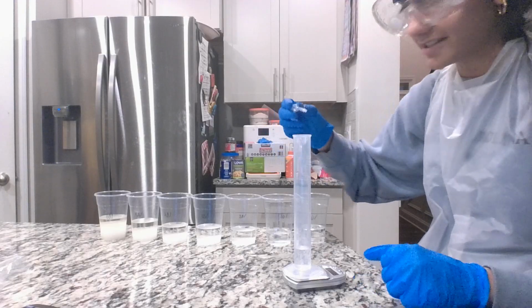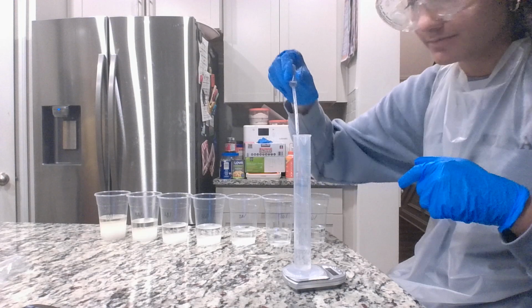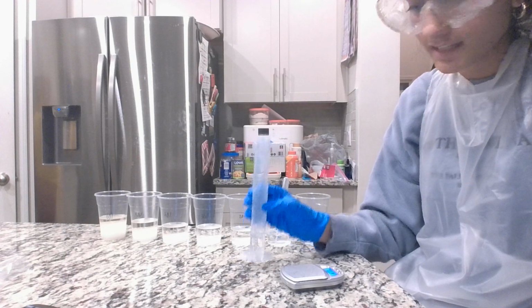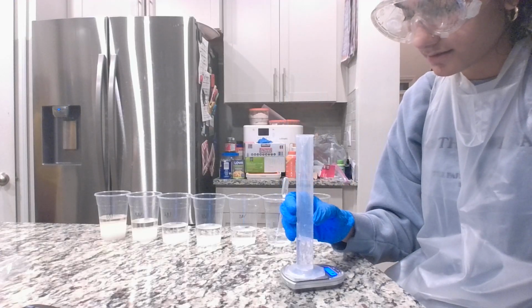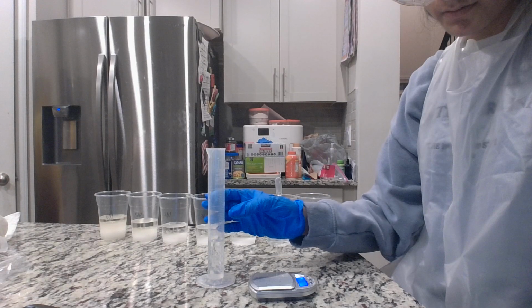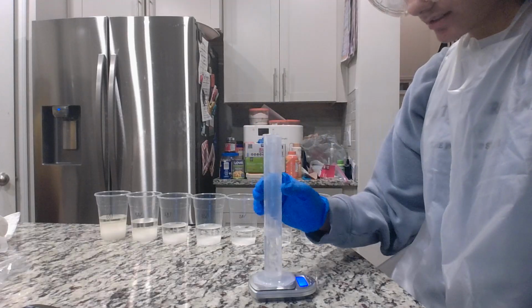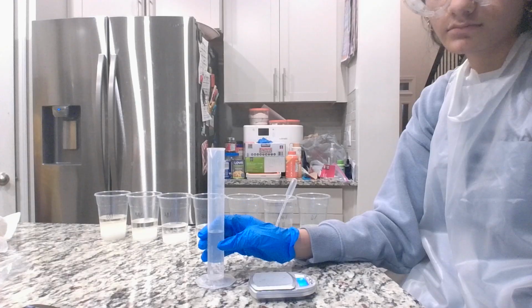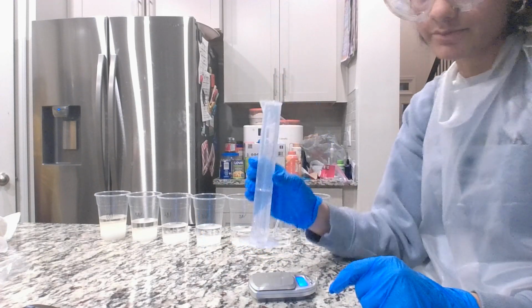Now I'm adding 10% of sucrose in solution. This is 15 milliliters. This is 20 milliliters. This is 25 milliliters.